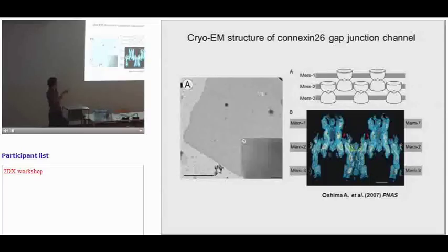So it's believed that the protein hemichannel in membrane 1 and membrane 3 are supposedly deformed. But the proteins in membrane 2 are protected from specimen drying and mechanical contact with carbon film.